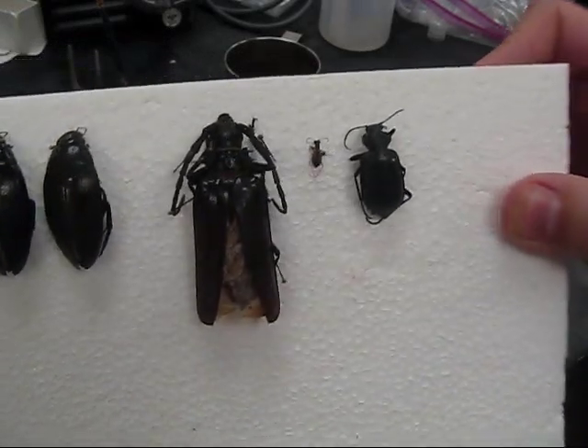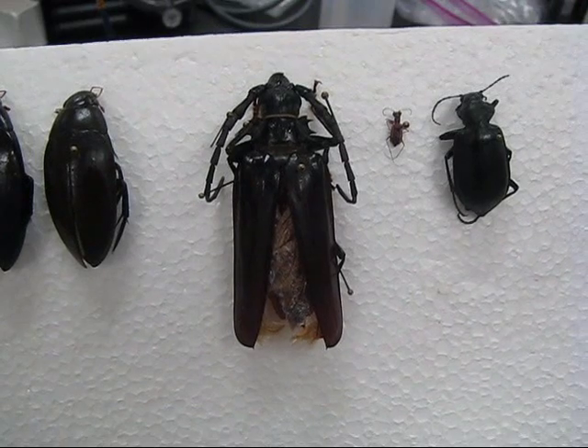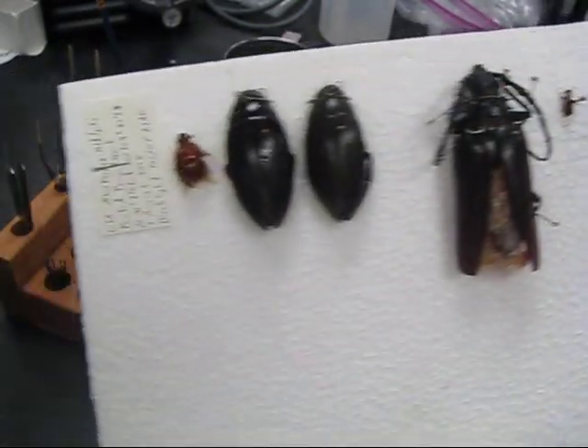You can see that the large longhorn beetle there had several pins stuck around it in order to keep the antennae, the legs, and the wings from spreading out while it dried.